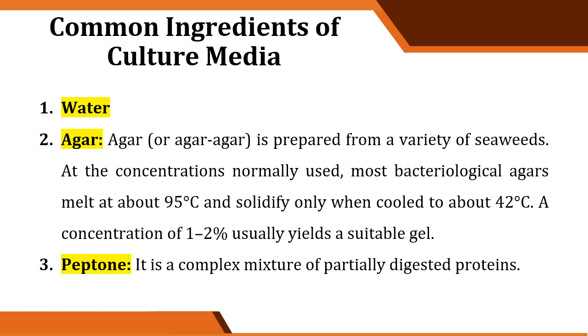So the water that we should use should be deionized or distilled water. Okay, so hindi tayo pwedeng gumamit ng tap water kasi hindi yun sterile. Okay, number one, hindi sterile si tap water. And second, it can contain certain minerals, for example, calcium, phosphorus, magnesium, yon, that could react with the other minerals or ingredients in our culture media.